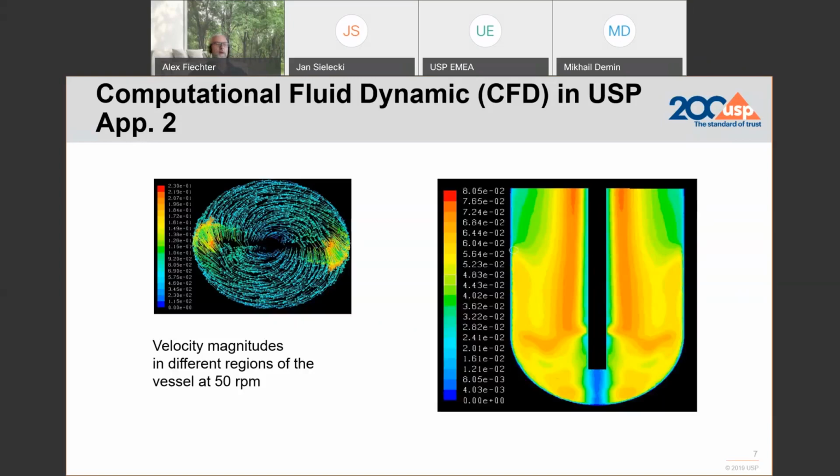And by the way, those of you who have witnessed the performance test already once, when the tablet starts to release, the first couple minutes when the tablet breaks apart down here, you see some material floating at the beginning, but suddenly after 5-6 minutes, everything starts to relax and the material comes down to the bottom. But what is shaped is this kind of a peak. And this peak for PVT is wanted.